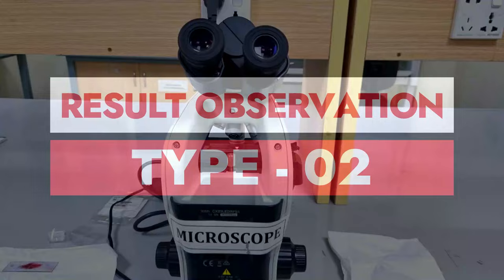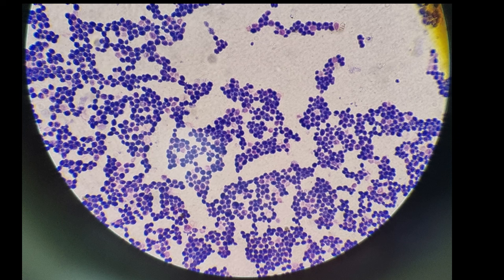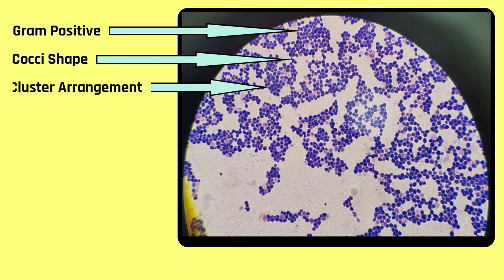Another type of view is given in the display. The bacterial color is violet or purple, and the shape is round or oval, and the bacterial arrangement is cluster. So we can interpret this result as the bacteria is gram-positive, cocci-shaped, and in cluster arrangement.